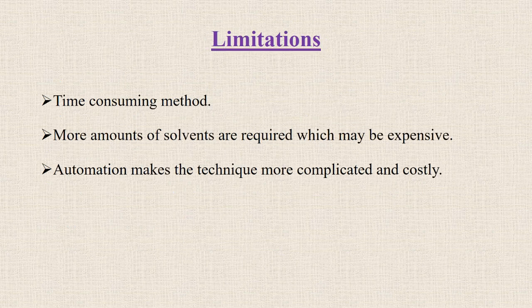In the limitations, it is a very time consuming method, and larger amounts of solvent are required, and as we know the solvents are generally expensive, and automation is a relatively costly technique, so we have to do it manually, which is very time consuming.